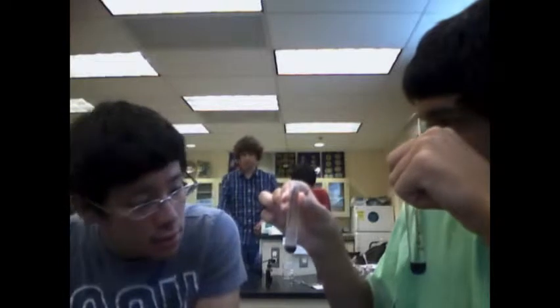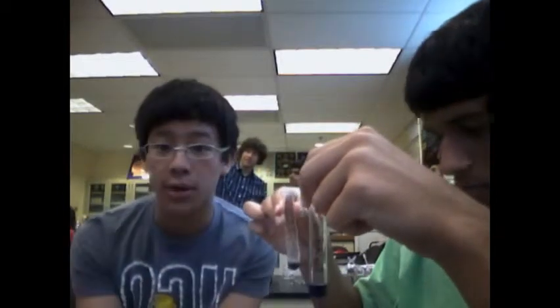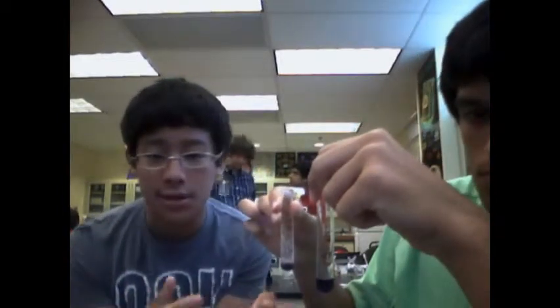That this contains proteins? Yes, because one is a murky grape color, while the other is a clear grape color, but they're still both grape colors. So it means that there are proteins in this unknown. The colors are the same, meaning the Biuret reagent reacted with it.